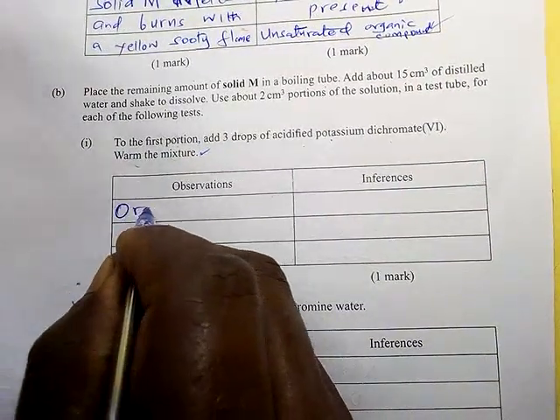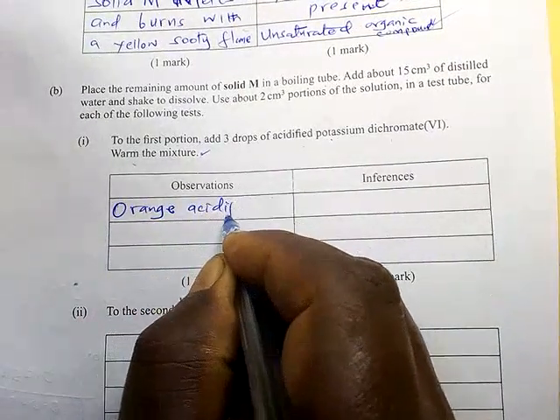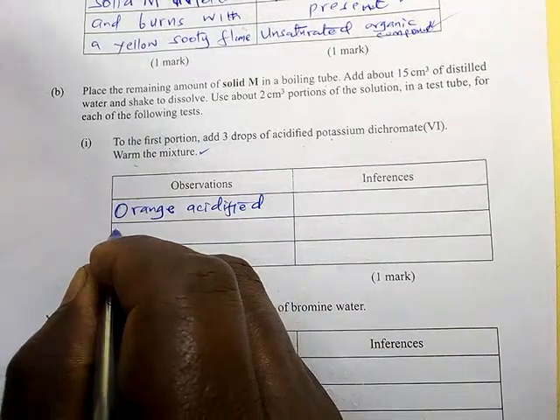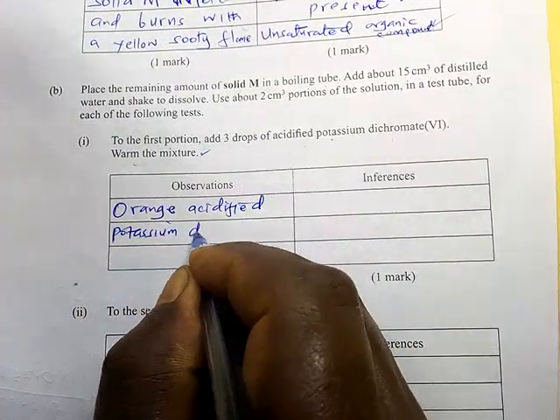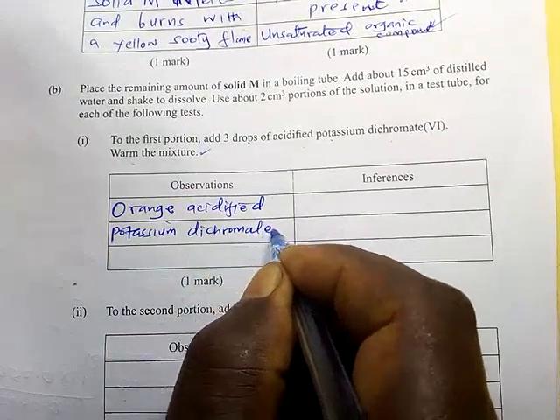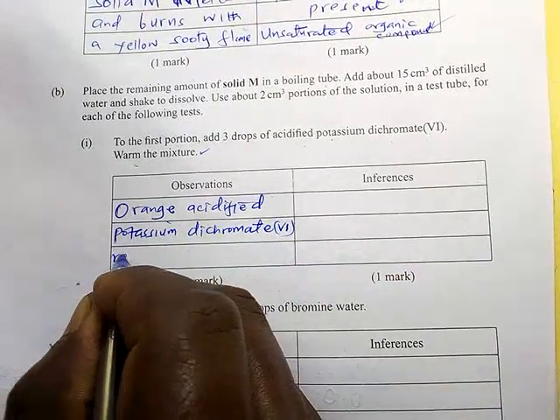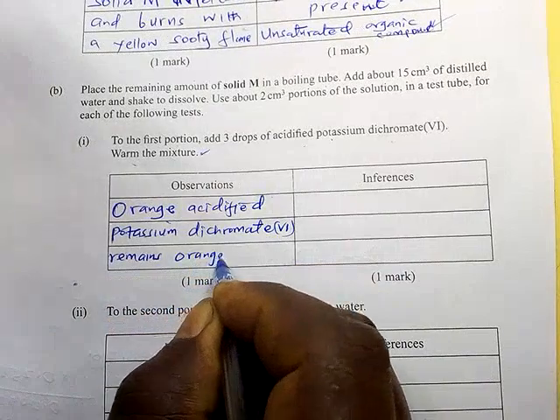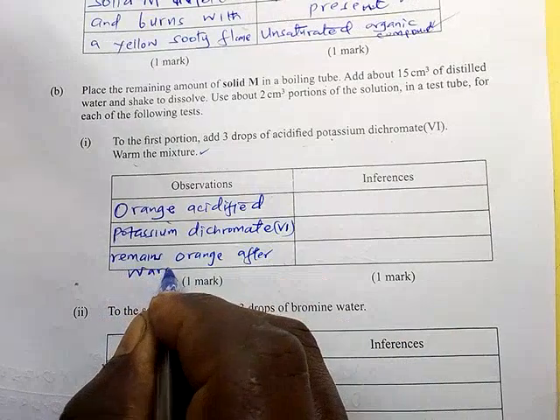The orange acidified potassium dichromate remains orange on warming.